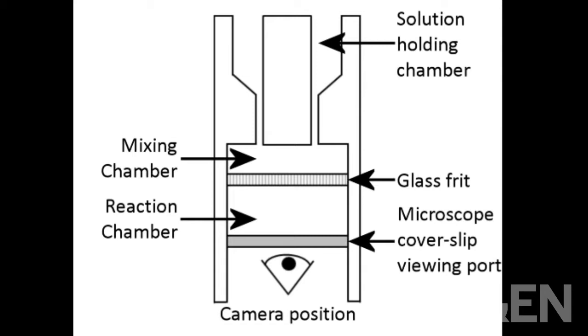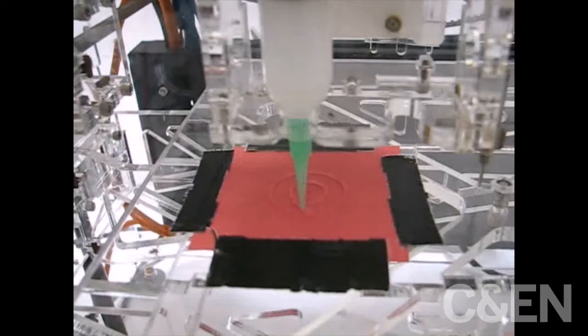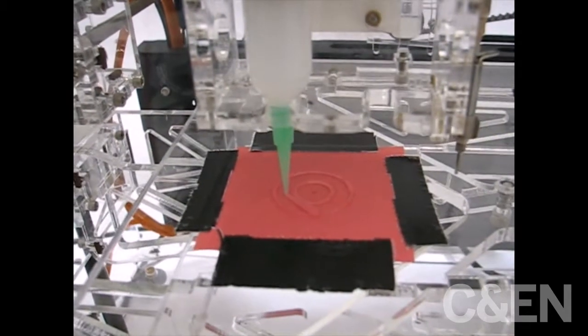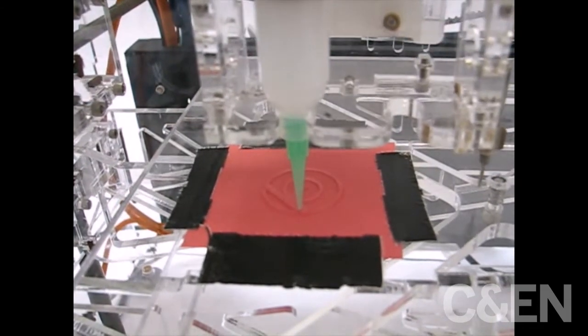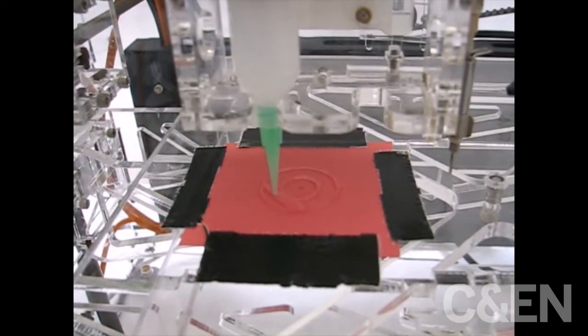To do this, they plan the structure of their desired chemical reaction vessel with computer-assisted design software. Then, they load the blueprint into the 3D printer, which builds the object layer by layer.